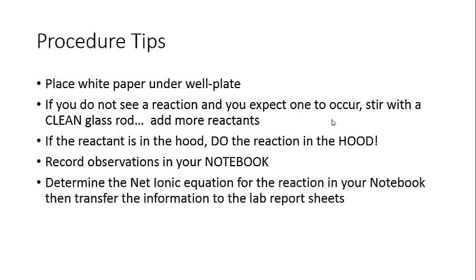If you have to go to a hood to get a reactant, make sure you do that reaction in the hood. Okay, so there are some toxic gases that could be emitted with some of these reactions. So you want to make sure that if it's in the hood, do the reaction in the hood.